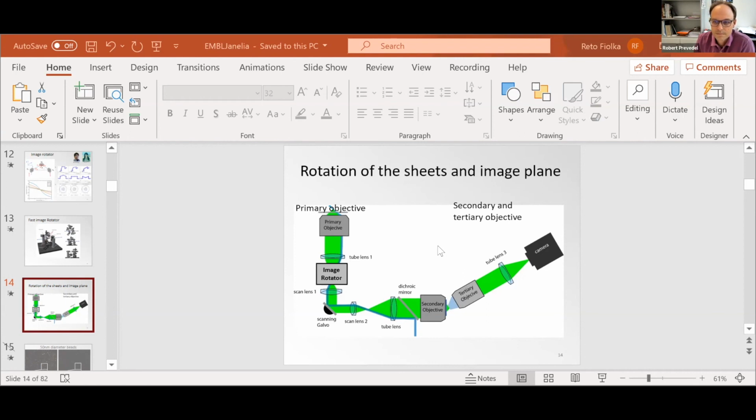It would be much better to do it in a multi-view fusion approach, so accept that these are different volumes that have also slightly slanted OTF and fuse that data in 3D. We got away with the slice by slice because the PSFs actually surprisingly align quite well with the z-axis. That's not a given. The OPM is such a weird beast that it kind of skews the PSF too. But here we were just lucky.